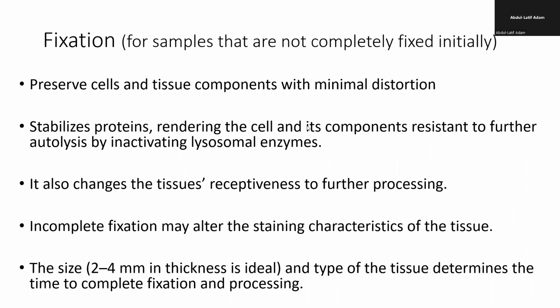So in order to keep the samples in that state, they have to be preserved to prevent the destruction of the cells. And that is the use of the fixative, okay? So you use fixative to preserve the cells in their architecture so that the cells will not become distorted. The cells will not rupture, they will not become swollen, but they will be in their normal state, okay?